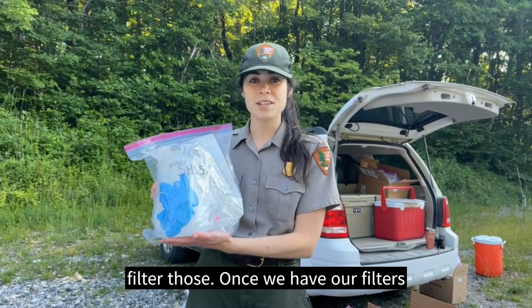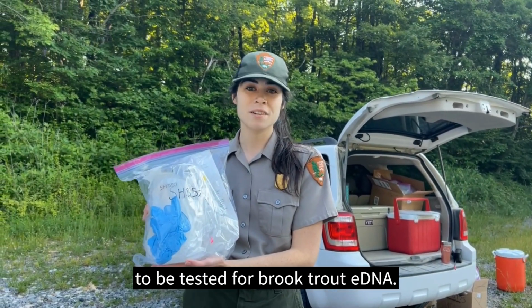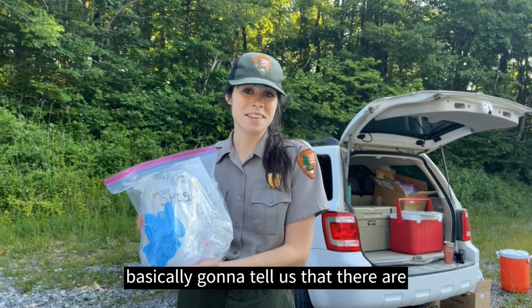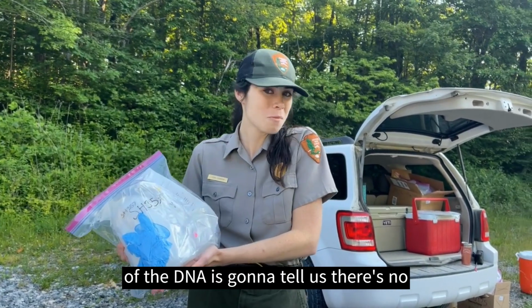Once we have our filters prepared, we're going to send those out to Fish and Wildlife, and those are going to be tested for brook trout eDNA. And the presence of brook trout eDNA is basically going to tell us that there are brook trout in those streams, and the absence of the DNA is going to tell us there's no brook trout in those streams.